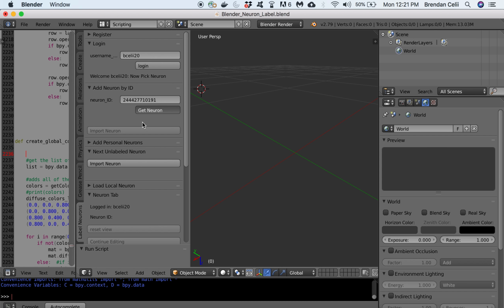This is the step that obviously takes a while. Just be patient. You can text, tweet, Instagram, all that stuff while you're waiting, maybe. Or do productive things. That works too.